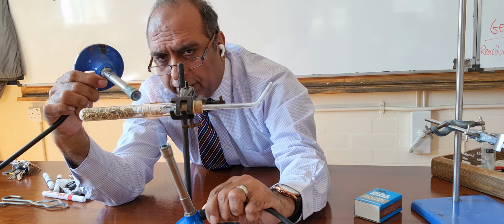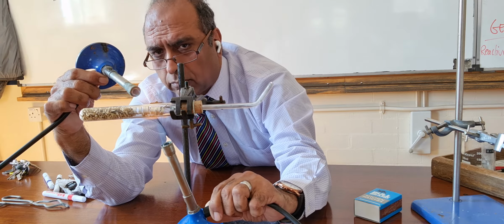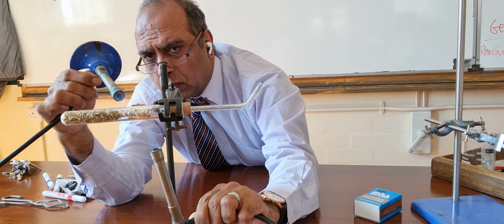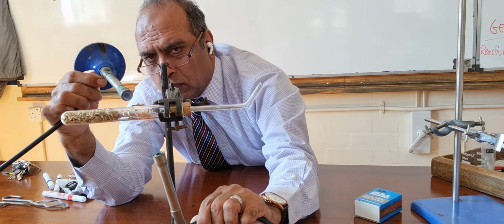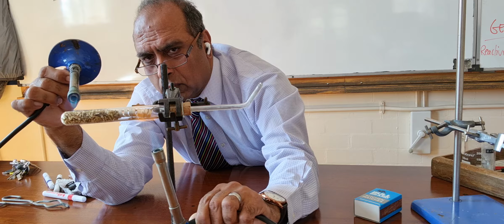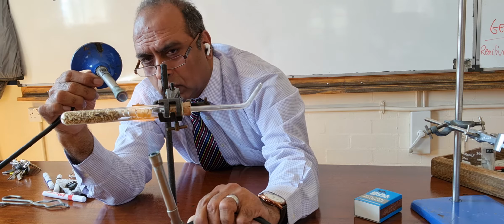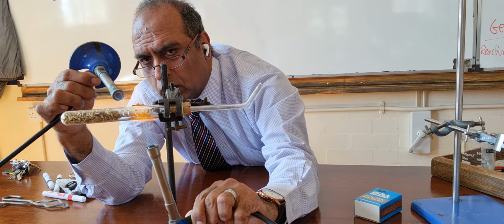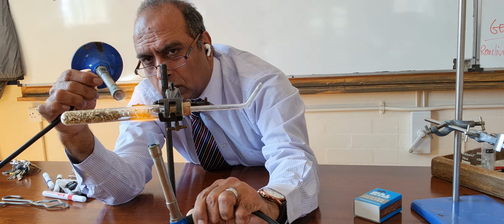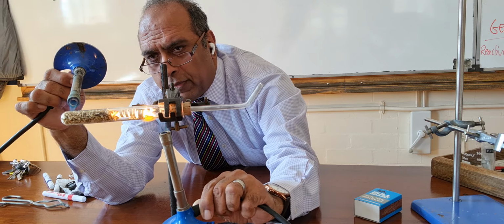Magnesium is simply not hot enough because the drops of water are cooling it down. Right, now it's going there.